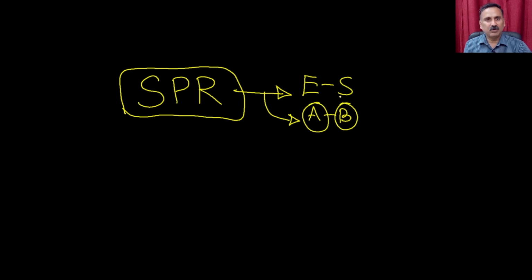For SPR, the system utilizes a pure enzyme and a pure substrate. So you cannot use multiple substrates in a single reaction, but you can measure any kind of interaction with pure enzyme and substrate combinations.